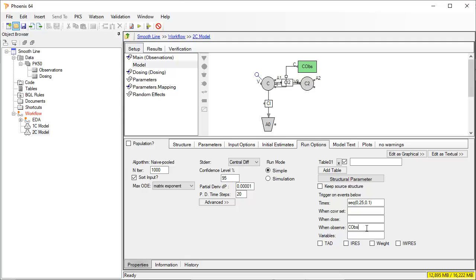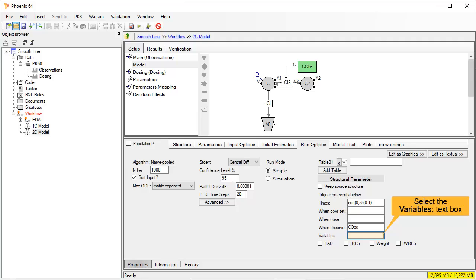We will also request the predicted concentration as the variable to be outputted. From the diagram, we can see that the predicted concentration in the main compartment is labeled uppercase C. We type C in the variables text box.